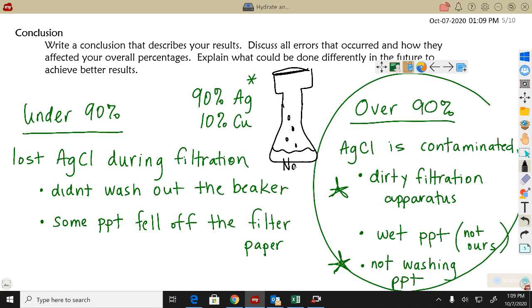Number one, it's sodium ions, it's excess chlorine ions, it's the copper ions, it's extra nitric acid from the first day. It's not water. I mean, there's water in it, but there's all kinds of junk in there. And all that junk will collect on my filter paper and add mass.